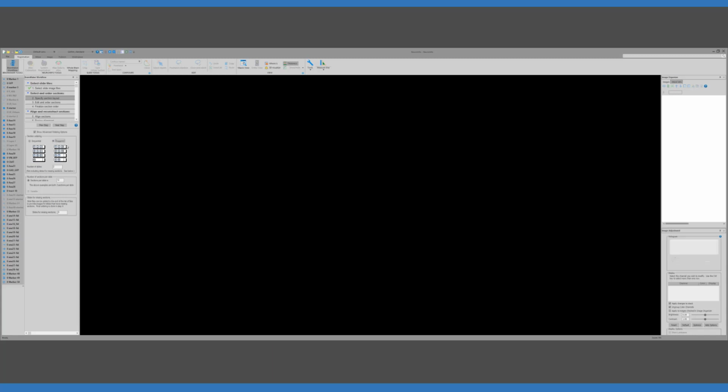That's when, as I showed you initially, you could mount a 1 in 10 series, each 1 in 10 series on a separate slide, and then use a staggered format, and that would take the first section and put them back in the appropriate order. However, for this one, we're going to use the sequential because that's how we've ordered them. There's a variable number of sections on each slide, and so that's what we select.